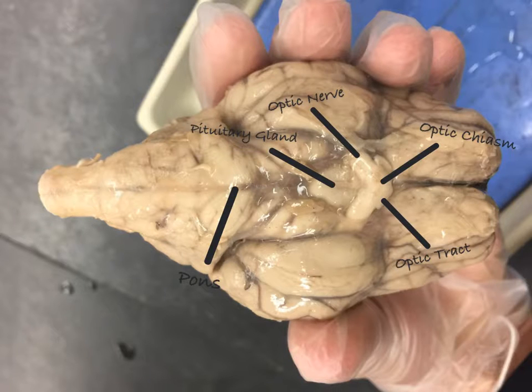All right, so this is the underside of our sheep brain. Starting up top with the optic nerve, it is a paired nerve that carries neural impulses from the retina, or the eye, to the actual brain. Then to the right, we have the optic chiasma. It's the part of the brain where the optic nerves cross with each other. Then we have the optic tract, and the optic tract is actually two different tracts. The left one and the right one are completely separate.